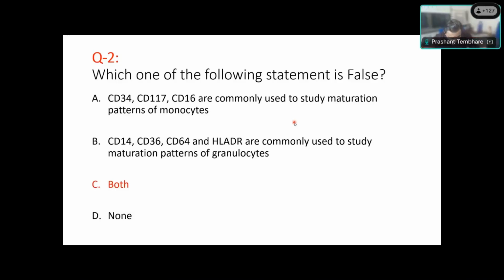You have to repeat that question. If the gating is based on a normal bone marrow sample, can it vary based on population types due to different genetic makeup? No. So that's what I'm saying. See, these antigen expressions are tightly regulated by gene expression patterns, and we know that in all human beings, gene expression is homogeneous across different races.